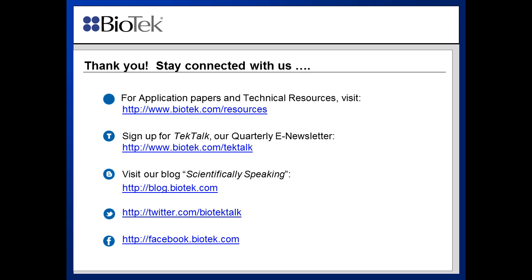One of the questions was, can neurons be used? The answer is yes. There's some particularly interesting work being done using aligned electrospun fibers on 3D models for neurons particularly. That's applicable. There was a question on how the mitochondrial concentrations shown earlier relate to the actual amount of mitochondria in the well. The simplest way to answer that, I suppose, is to say that our assay volumes are typically about 100 to 150 microliters, so essentially 10 times less than the mg per mL values that you'll receive on your slides.